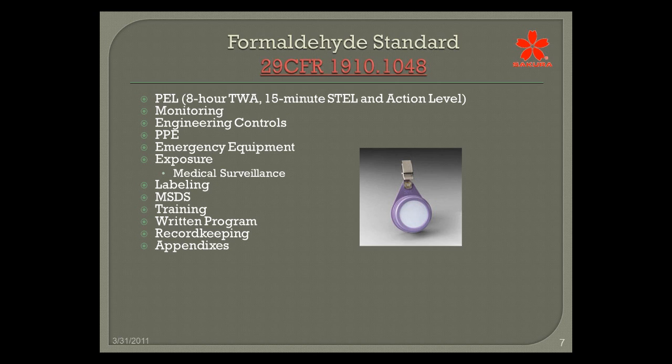MSDS. So if you have an MSDS for a formalin solution from, let's just say, Fisher Scientific, or I don't know what they're called now, Thermo Fisher, but you're getting your formalin from Poly Scientific, is that okay? No. You actually have to have the MSDS for that specific company, and the catalog number should be available to you. You can't just have a generic MSDS for 10% neutral buffered formalin, nor can you have a generic MSDS for any of the solutions that you have. You have to actually have it for the specific company and catalog, and it must be kept on file in the lab or in a specific area so that it can be accessed during an emergency situation or for just general reference.